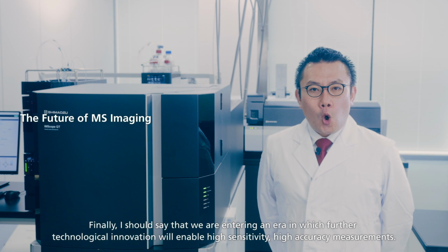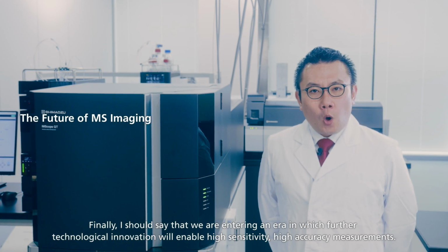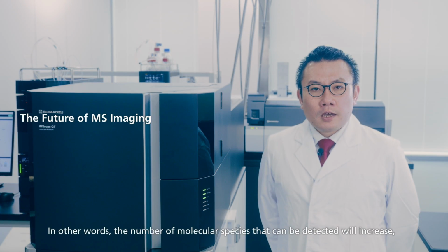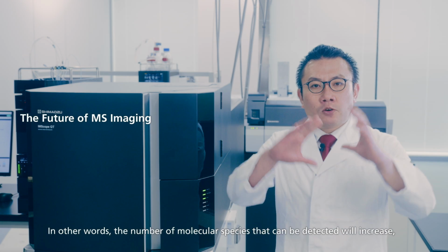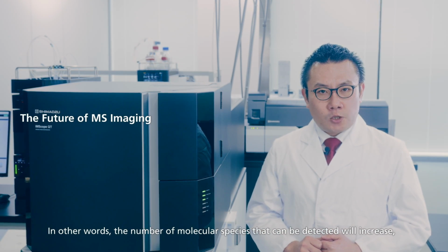Finally, I should say that we are entering an era in which further technological innovation will enable high sensitivity, high accuracy measurements. In other words, the number of molecular species that can be detected will increase.